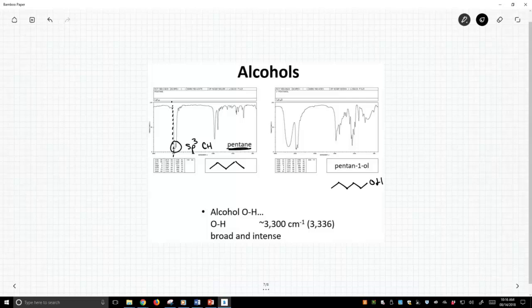Those are our sp3 CH's. Now these peaks to the right of the spectrum mean something, but they're all just past 1500, and we're not going to worry about those. So let's ignore all of that. This is our main peak of interest, sp3 CH's.